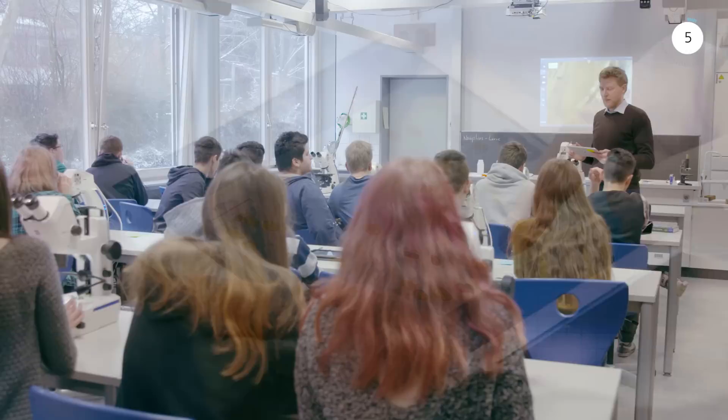Inspire your students in a digital classroom. With Zeiss PrimoStar 3, you can connect their microscopes to each other in a collective learning network.